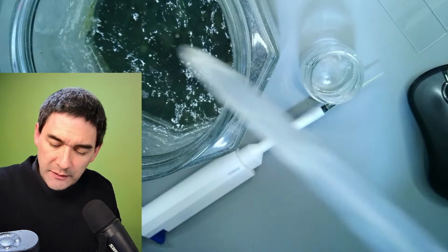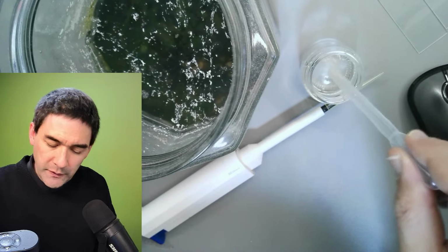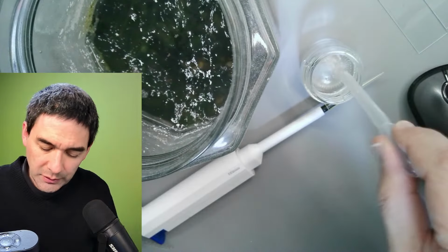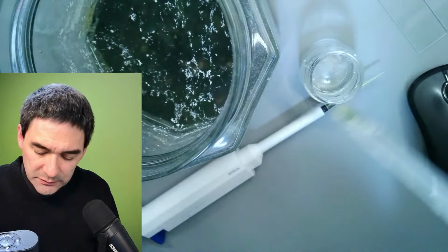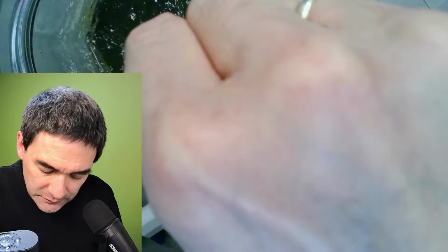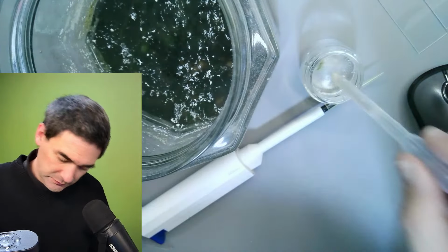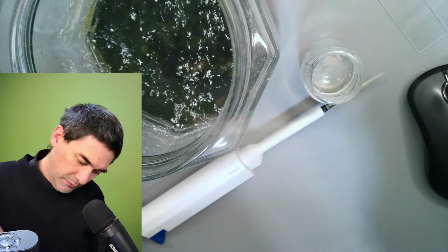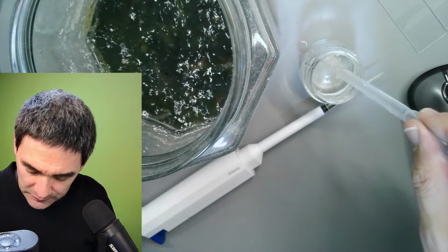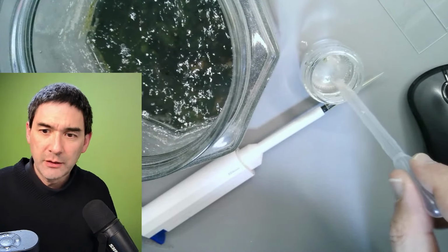And again, I have to say, we're dealing with living systems here, and they sometimes are difficult to control. So sometimes it's a question of trial and error. A little bit of some green stuff as well. Okay, maybe one more. So there'll be plenty of microorganisms in here.